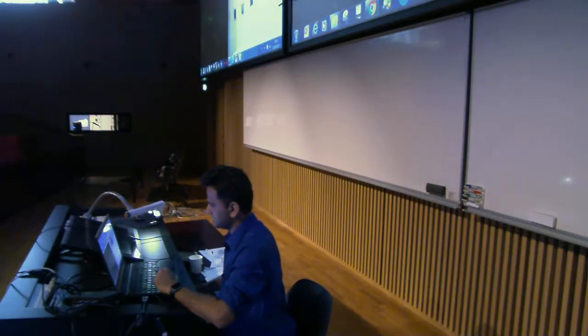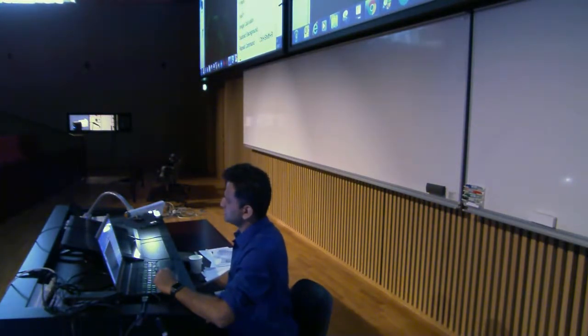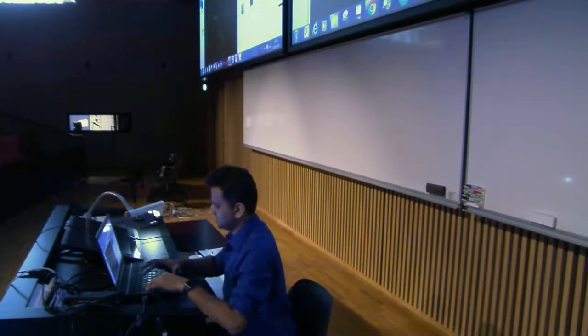That would be easy for understanding. You can smooth it, right? So smoothing is just making it more blurry, kind of, right? And you can do it multiple times. So Control Shift S, Control Shift S, and if you keep on pressing, then it becomes blurry, right?